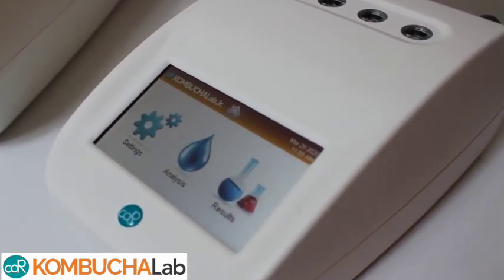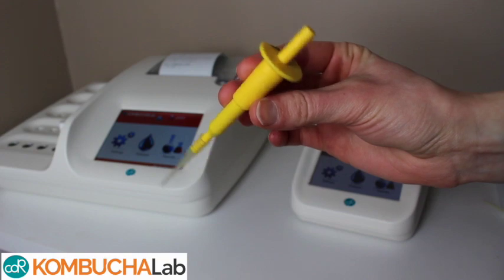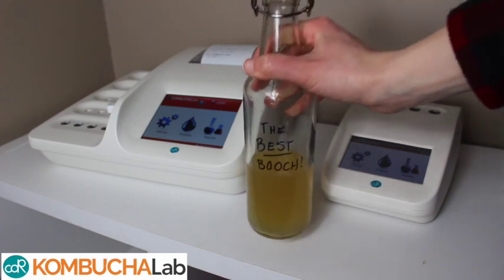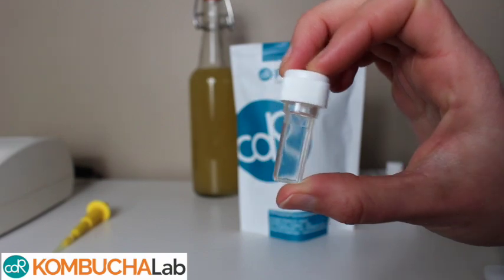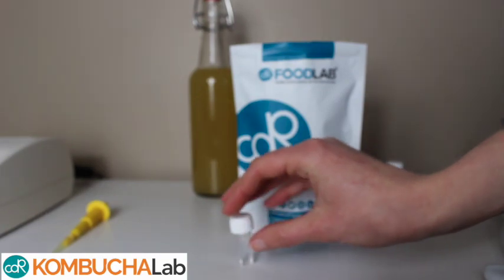In addition to a CDR Kombucha Lab Analyzer, all you need to get testing your kombucha are the necessary pipettes, which come with the analyzer, the specific reagent kit for the test you want to perform, and of course, your kombucha. CDR has a specific reagent kit for each test. The kits include pre-filled cuvettes and any needed secondary reagents.